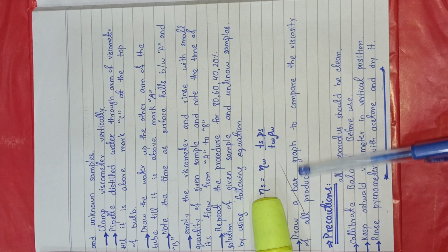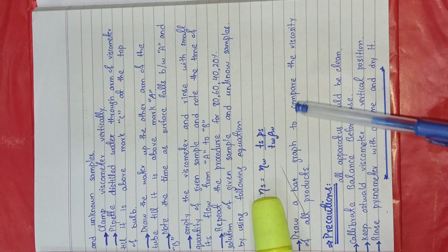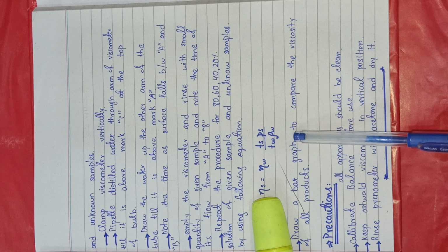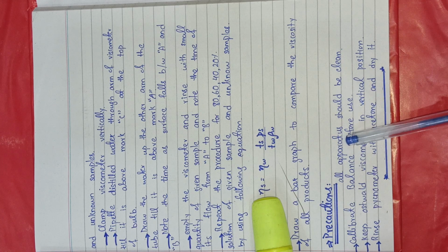At the last, you will draw a bar graph to compare the viscosity of all the substances, to show which is most viscous and which is least viscous, and you will define it by the graph. At the last, you will write down the precautions, and all the apparatus should be clean.